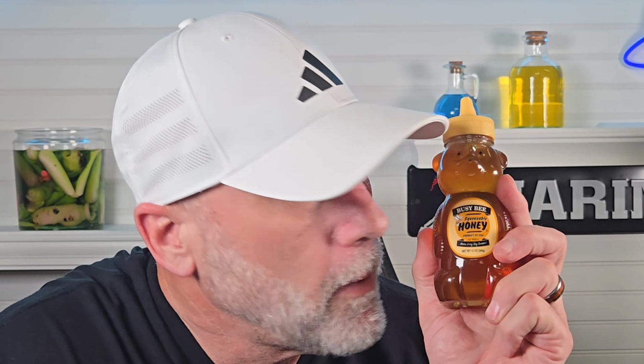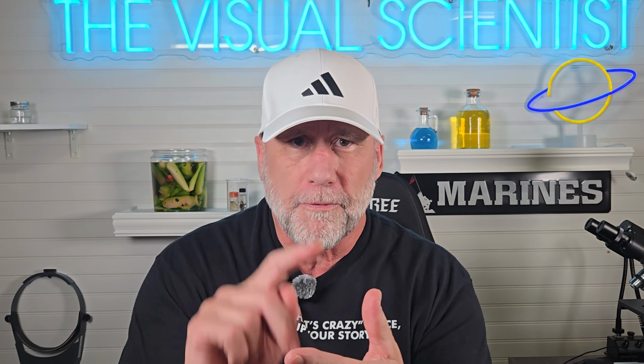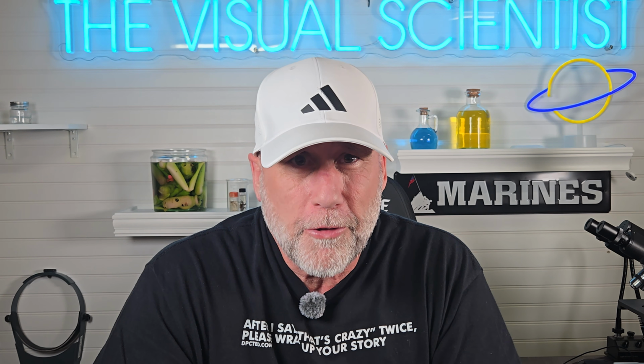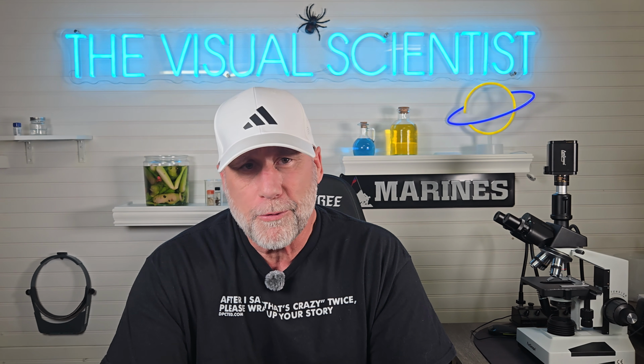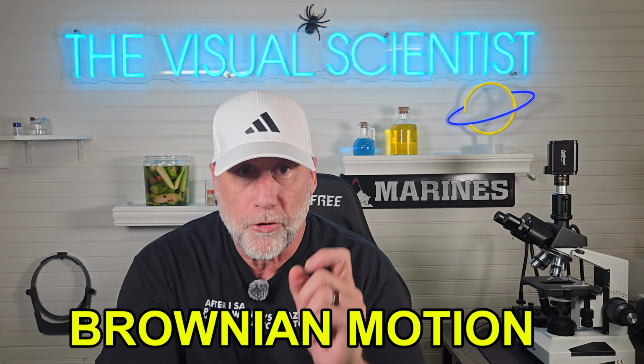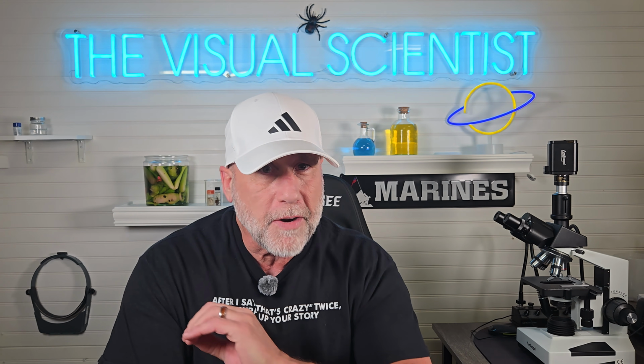Evidence B, Busy Bee squeezable, the little bear. I give him a grade D minus, and I'm being generous. Featureless at 400 times, almost no crystalline structures at any magnification. And those moving particles I told you about, remember, at 1,000 times, that's Brownian motion, microscopic particles being knocked around by free water molecules. You guys ever hear about that?